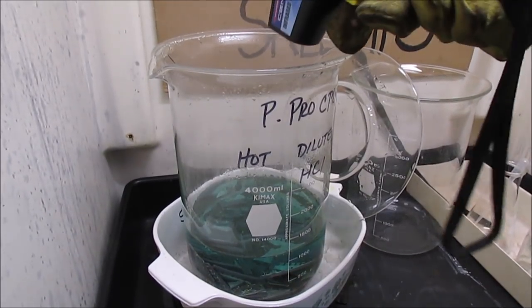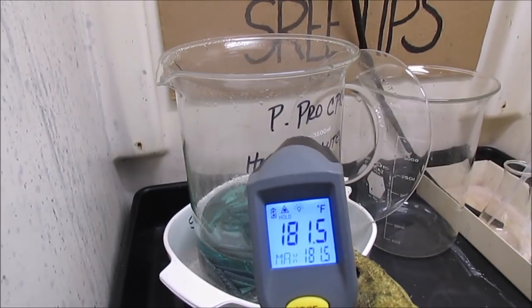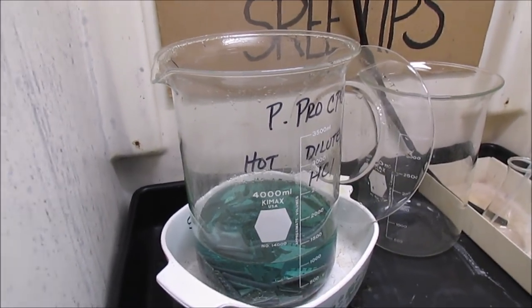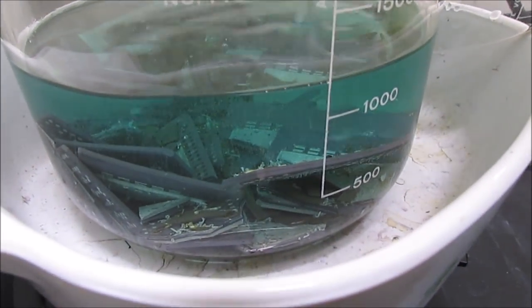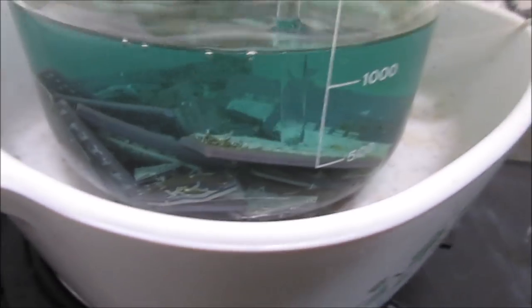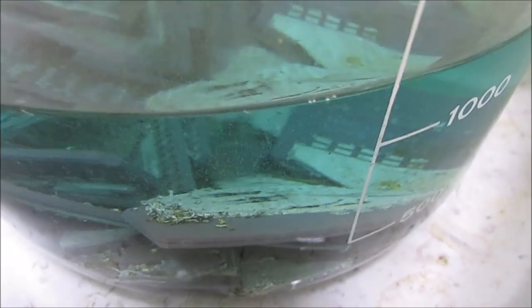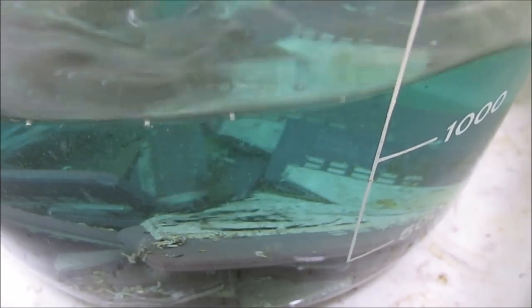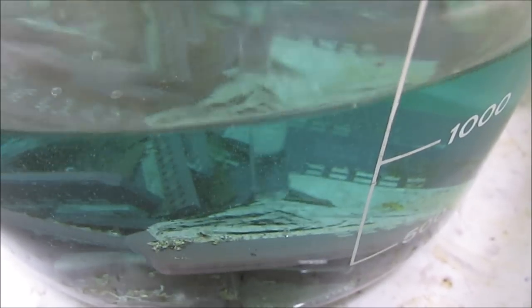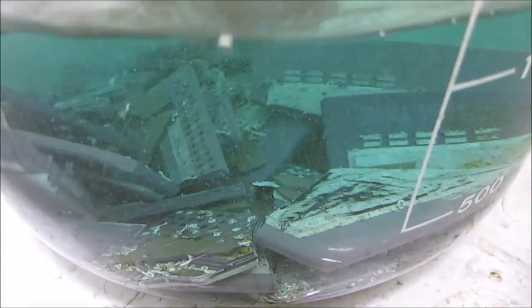It's been about an hour since I put this second treatment of hydrochloric acid on. We got the temperature up to 181 degrees. I got to looking down in here and I noticed that it's like the foils are flaking off the CPUs now pretty good. That's what I wanted to see. So this is going to work out pretty good, I think. Just going to let this cook for a little while longer and continue on with the experiment.